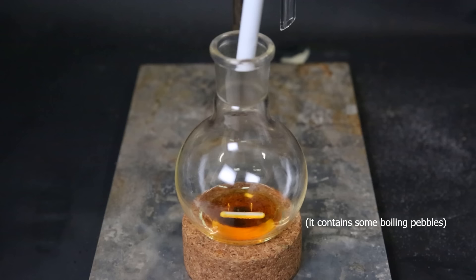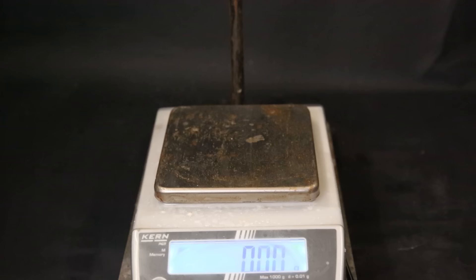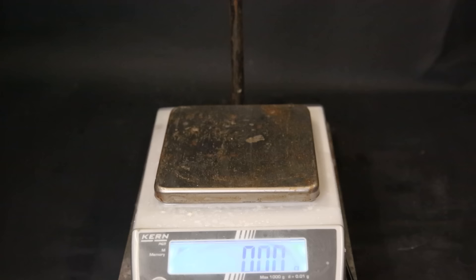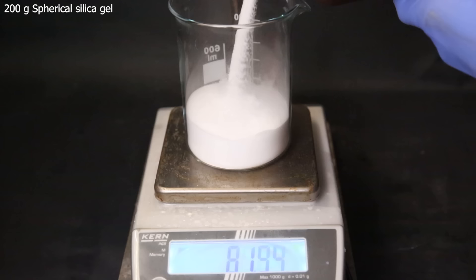So to separate the remaining furfural and levoglucosanone, I will have to do column chromatography. For this, I will use spherical silica gel. So I set up a beaker and weigh out 200 grams of the silica gel.